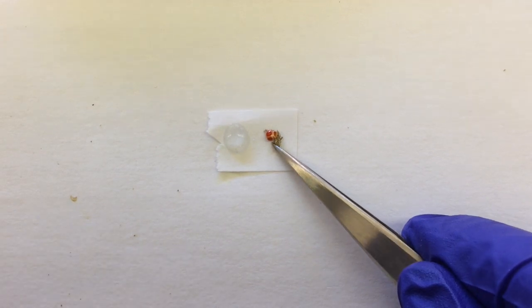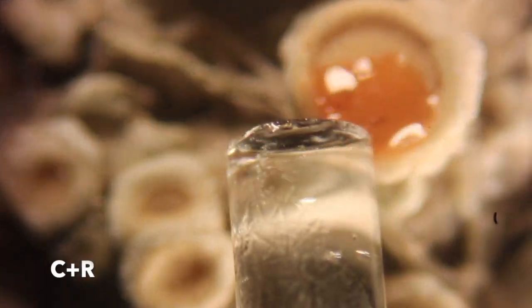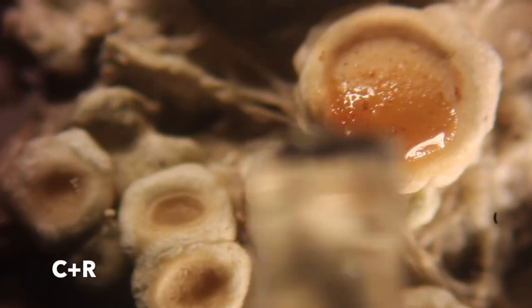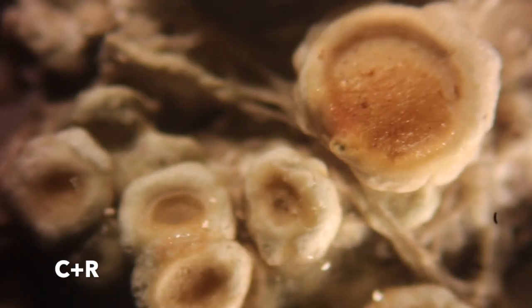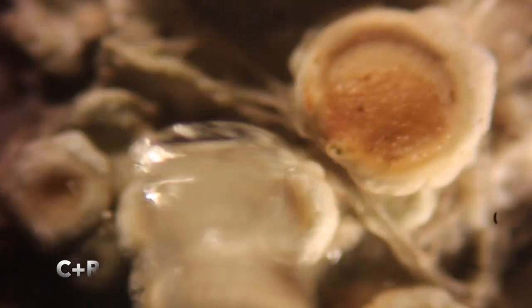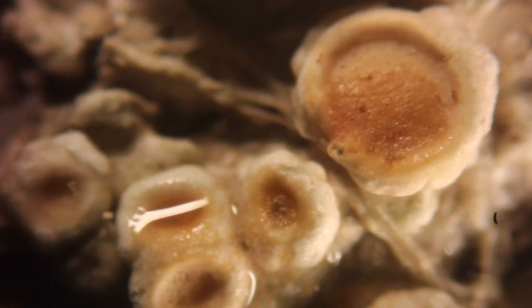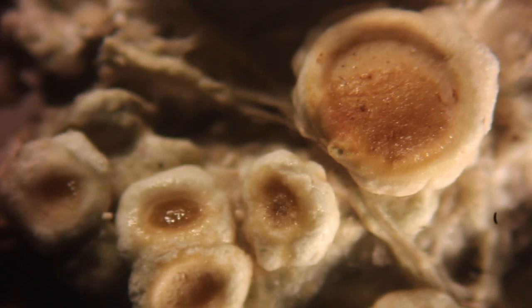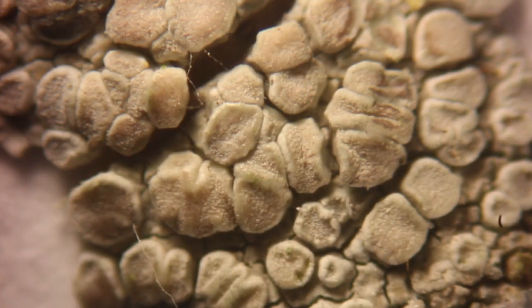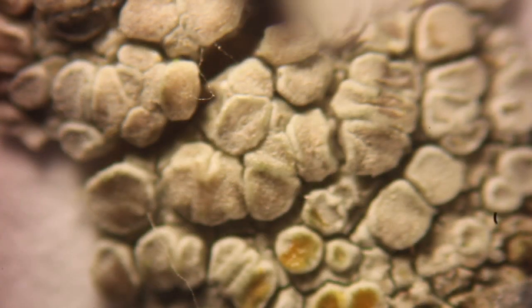Did you see that disc turn bright red? Let's look at that up close. This reaction initiates immediately and then quickly fades. Our next example of a C-test is a C plus Y, or a C plus yellow reaction.